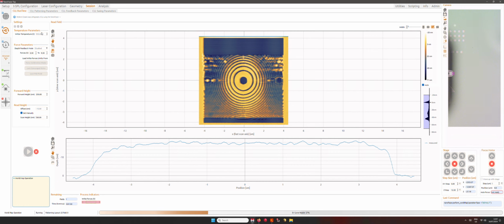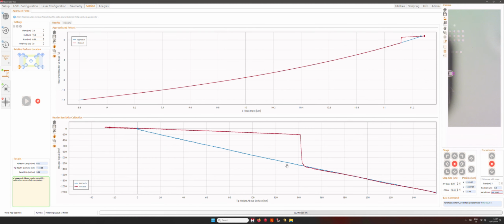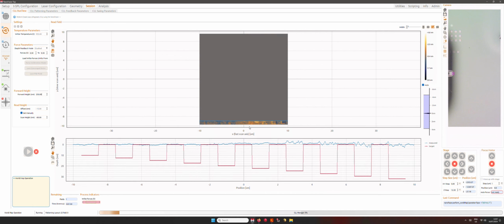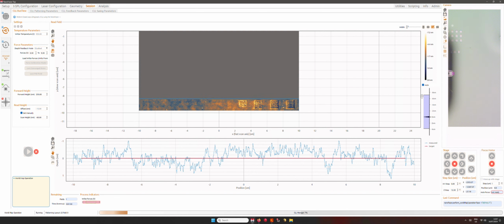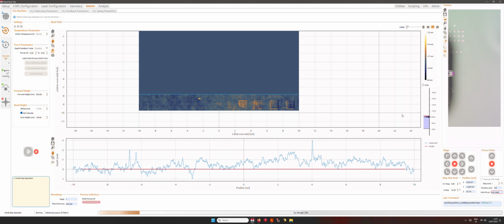We also see that because we're using the temperature map, of course the temperature is blocked here, and we will use the temperature value that is within the temperature map. So I would say now we see the results. I'm not sure about the quality of the tip. It's not so good, so we may struggle in doing the patterning, even if we're dealing with some squares, but apparently not here, even if we're at very low temperature.